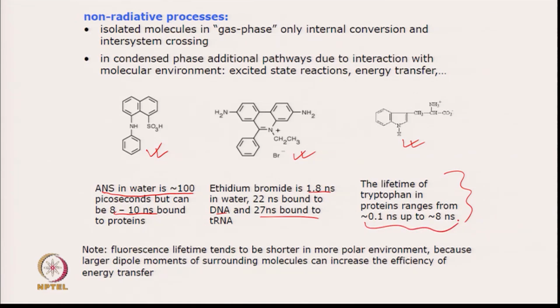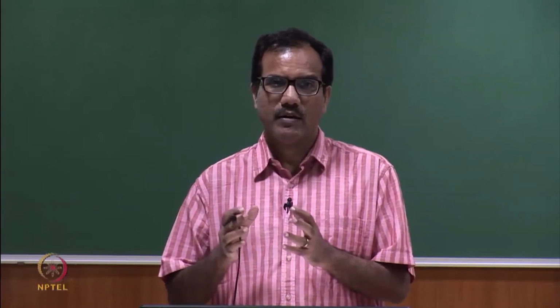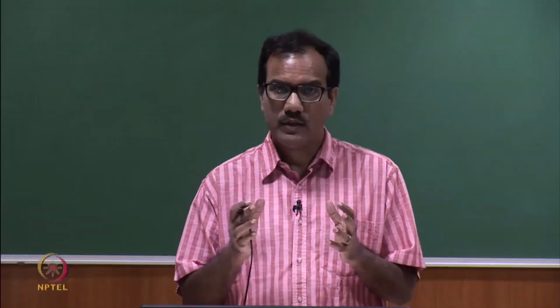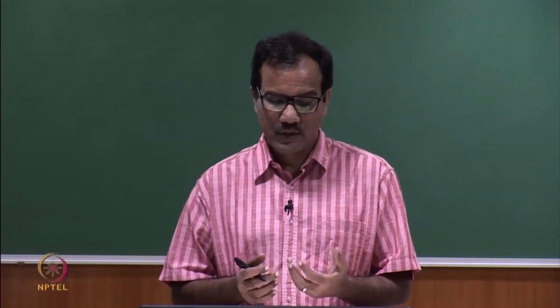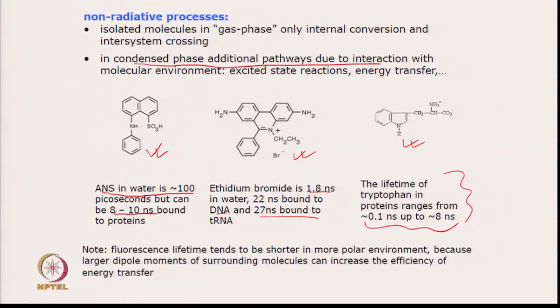What that means is your lifetime is affected by the environment of the fluorophore, and this happens since in the condensed phase additional pathways due to interaction with the molecular environment open up, and so lifetime may change.